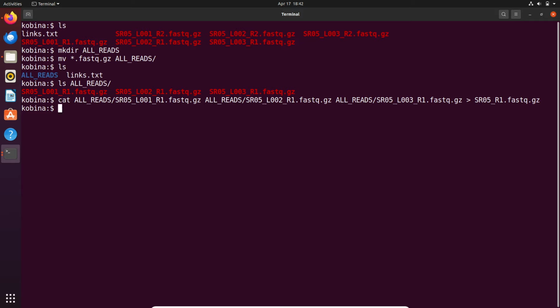Perfect. It's done. This is a small file, so it doesn't take much time. If it's a larger file, it will take some time, right? If I do an ls now, I'm going to see it here. Okay, this is it.